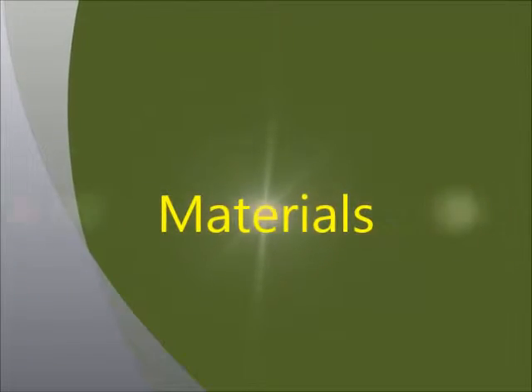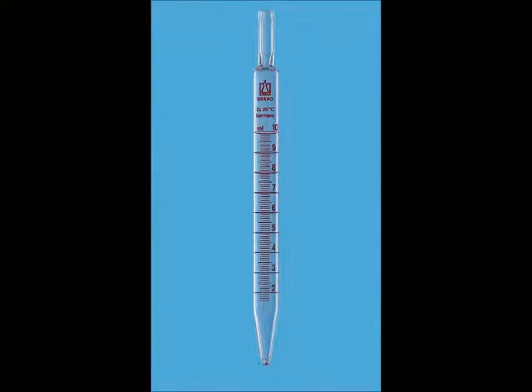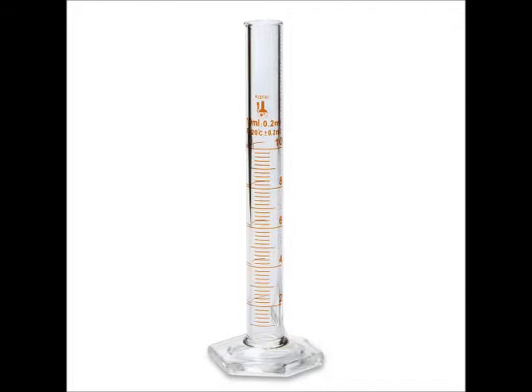Before any lab, you should review the materials that are needed. In this lab, we'll be using a pipette, a graduated cylinder, a beaker, and a blue suction bulb.